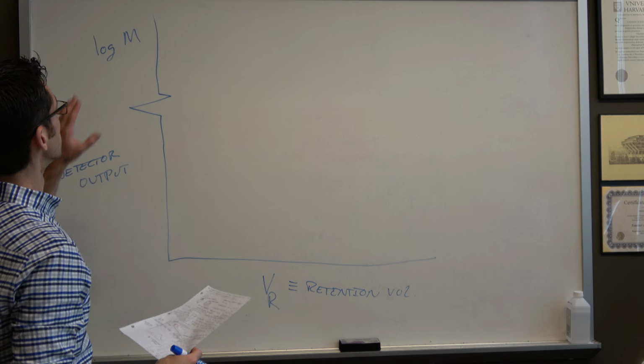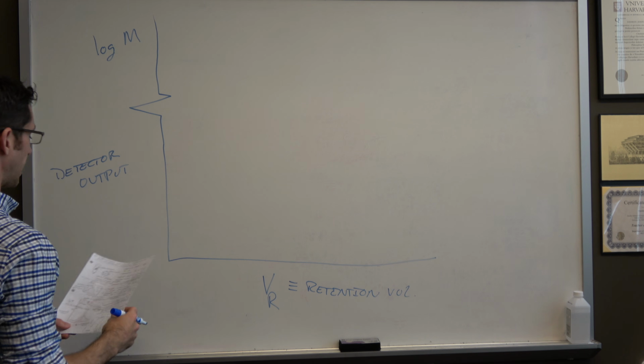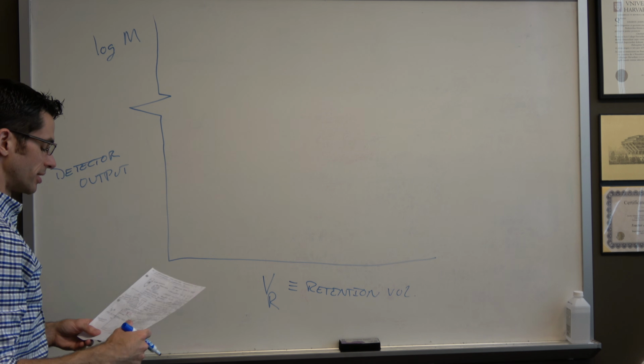So we'll plot log of the molecular weight up here and the detector output down here.